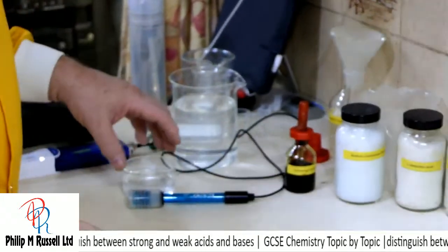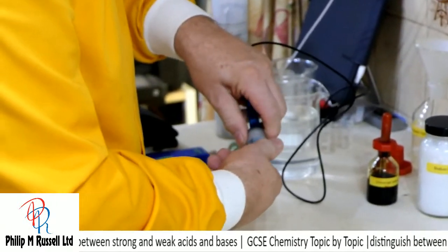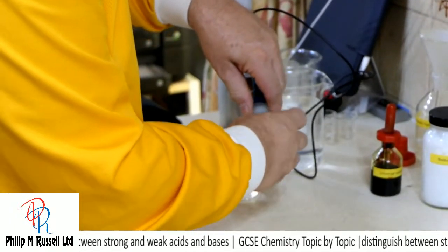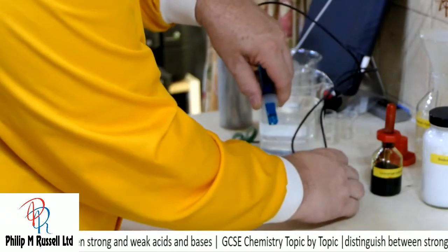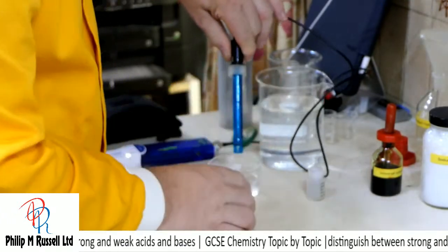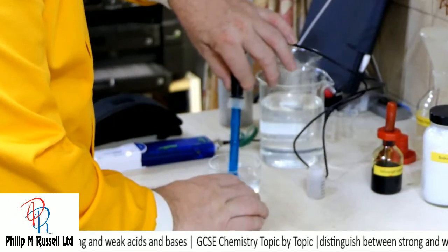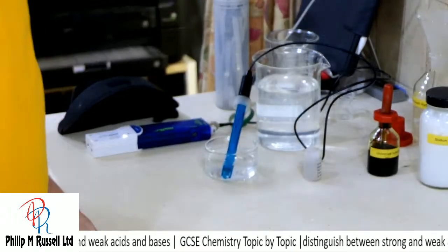To do this, what I'm going to do is have a look at a few of these acids, and what I've got is my pH meter, and I'm just going to stick this into some distilled water.